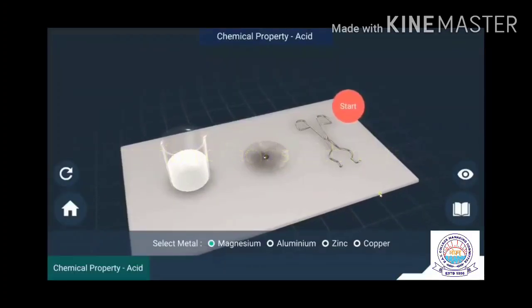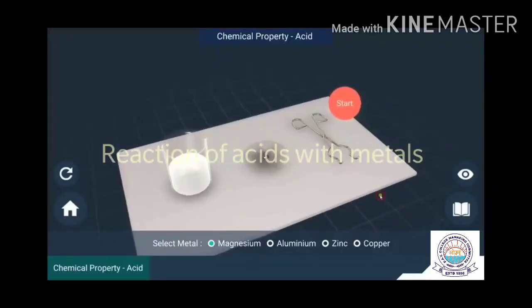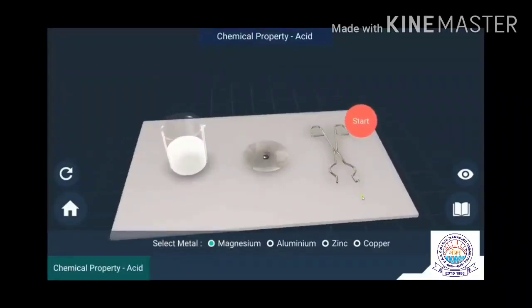But watch this carefully. I'm going to narrate what I am doing, and you will understand how the acid behaves. The properties of acid can be reanalyzed through these animated videos, with my narration of course. This is a virtual lab type of experiment, and there you will understand how acids or bases behave. We will do three very special experiments today. See them one by one. We will do our first experiment on the reactivity of metals with acids.